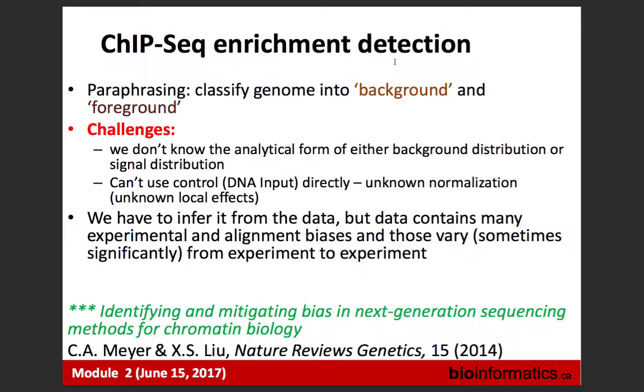First of all, input is used in many tools for other purposes. There's not only one purpose; we are coming to this. Second, when you have this huge coverage, this coverage is 10,000 in those spurious locations, you have fluctuations. Say in your cancer sample you have coverage 5,000, and in your normal sample you have coverage 15,000, your differential analysis tool can detect the difference, although this difference will be just due to fluctuations. They both are super enriched.